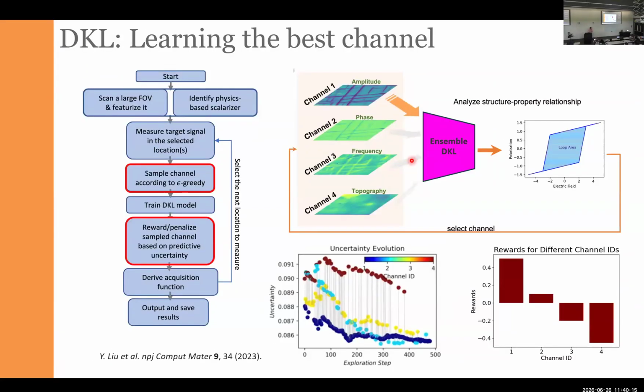So it's possible to build upon this type of component. For example, one of the great things about scanning probe microscopy is that you have multiple information channels. As I mentioned, there is a difference between SPM and STEM, because in STEM, very often we have access to the basic image channel, which is our ADF image, and then we can choose which of the spectroscopies to take.